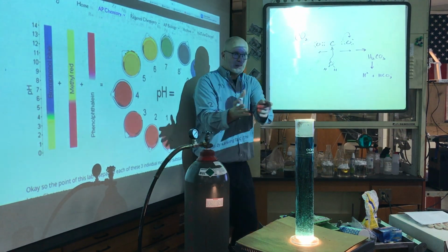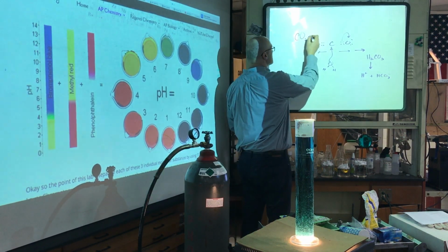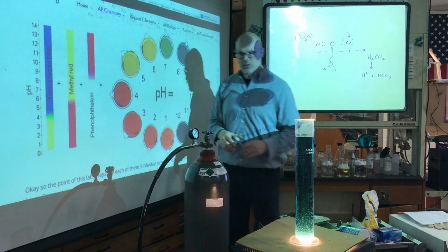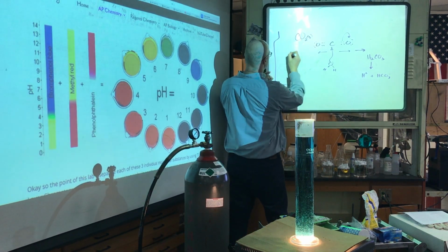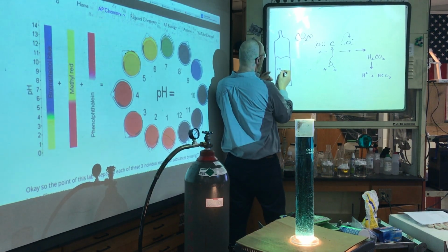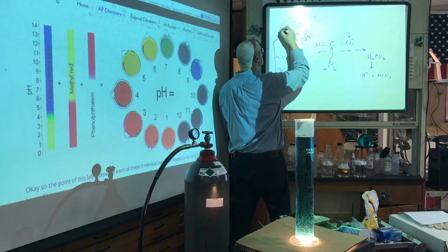So we want to drop CO2, and CO2 in the air is hitting it, but I want to make CO2 solid. That's kind of cool since we're talking about intermolecular attractions. What I have here is a tank. Let me show you what that looks like. There's liquid CO2 in here, and obviously, it's connected.